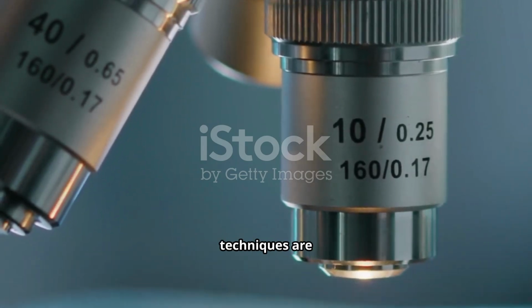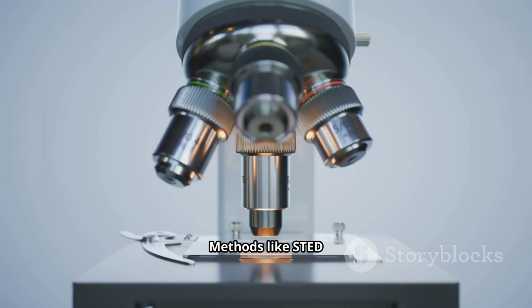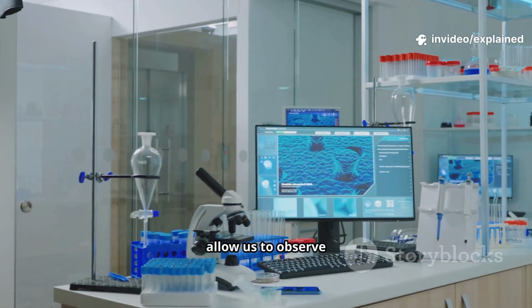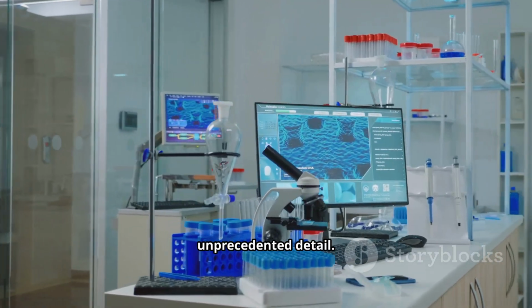Super-resolution microscopy techniques are breaking the traditional limits of light microscopy. Methods like STED and PALM can achieve resolution below 50 nanometers using visible light. These techniques allow us to observe molecular processes in living cells with unprecedented detail.